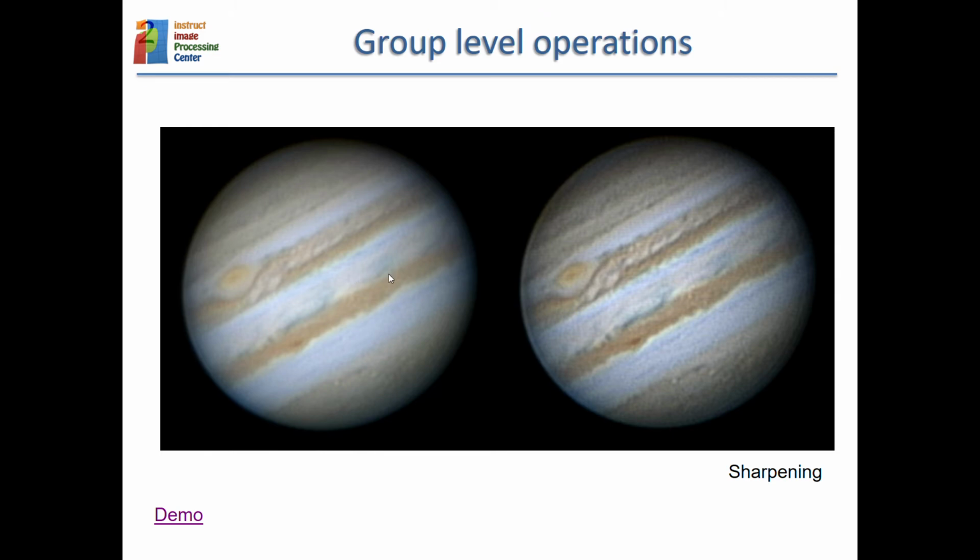That is actually what happens when you use the microscope with very large defocus. The associated kernel to very large defocus is very large, so information that was very far away from the central pixel gets mixed into the central pixel. And when you decrease the defocus, then you are decreasing the point spread function. So now the information content is much more concentrated, so the values from a pixel only come from a narrower area around that pixel.